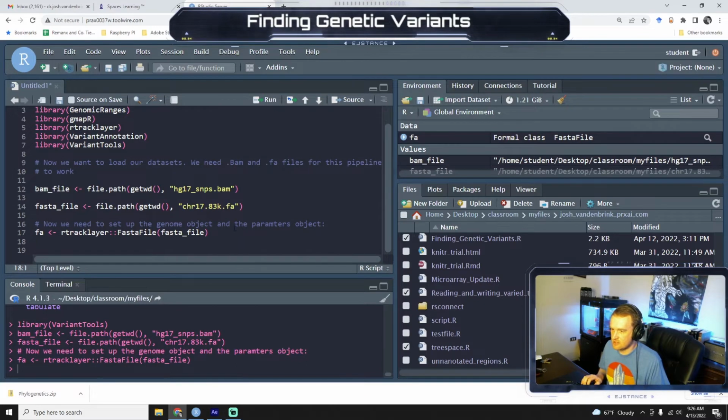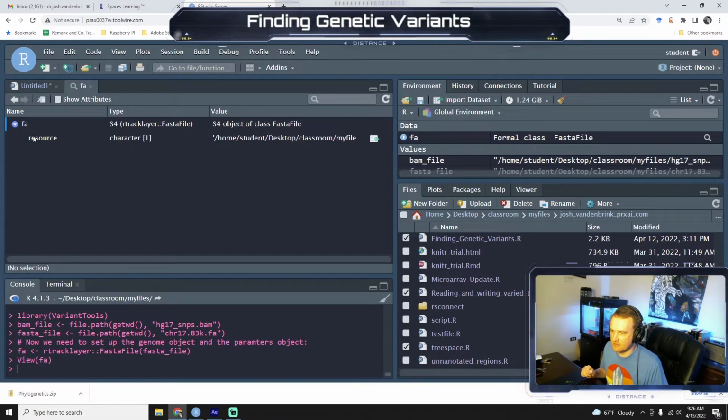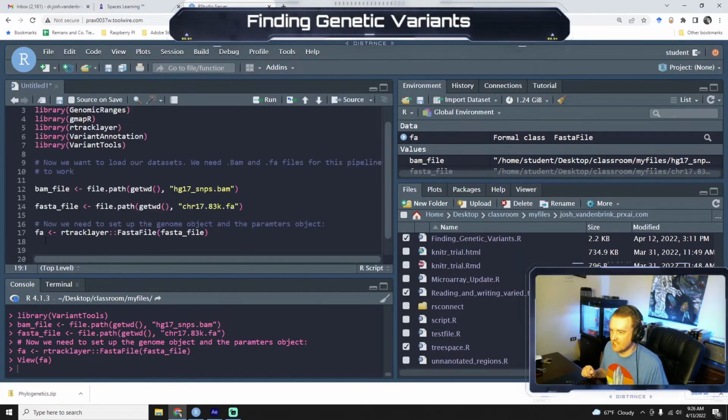Let's see if that works. Okay. So now you can see if we click on this, we have our FASTA file loaded in.